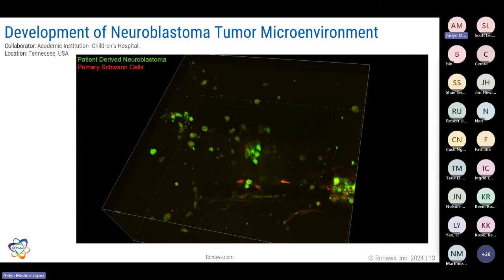And this is an AXR confocal imaging of just one pore of one side of the block. And I emphasize that: one pore, one side of the block. We're only imaging about 1% of the entirety of the block, which is 1 centimeter cube. And this is how much we're getting out of how the cells are interacting with each other.